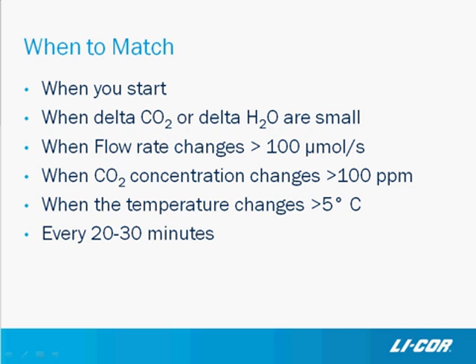It's difficult to match too often if you are matching correctly and not getting any error messages. My protocol in graduate school was that we matched every single plant, so that would be 2 to 3 minutes between matches. As long as you're not getting error messages, that's fine.